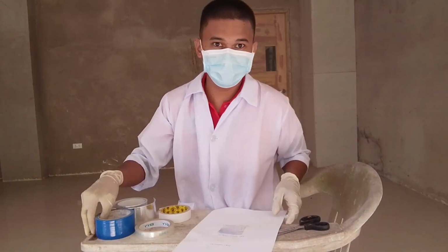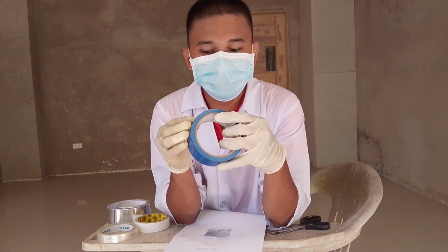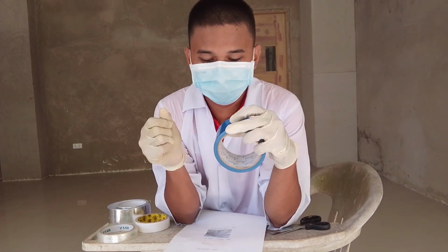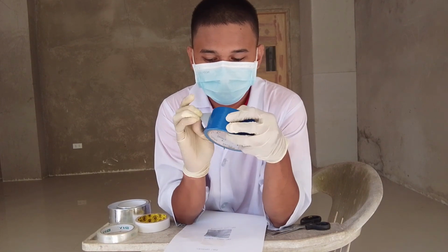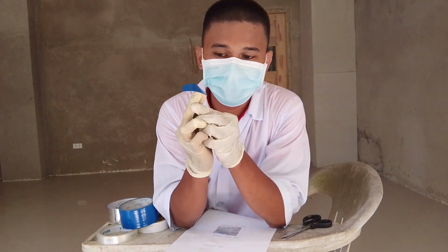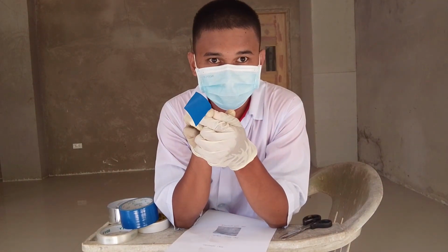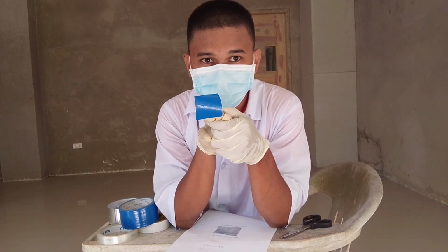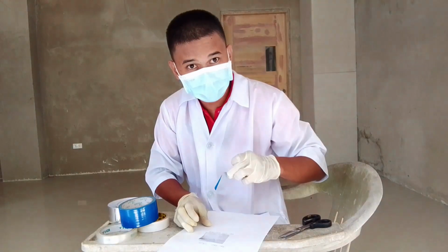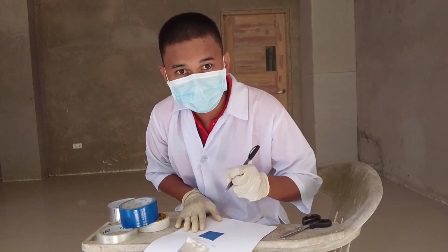I will now proceed to the last tape, which is the duct tape. The duct tape is also an adhesive tape, and is commonly used for repairs, any kinds of repairs, and packaging. I will now get a sample. I have here the sample, and the size of this is 2 by 2 inches, and the color of the duct tape is blue. The edge characteristic of this is also flat. I will now put the sample in the paper. After putting the sample in the paper, I will now label it.